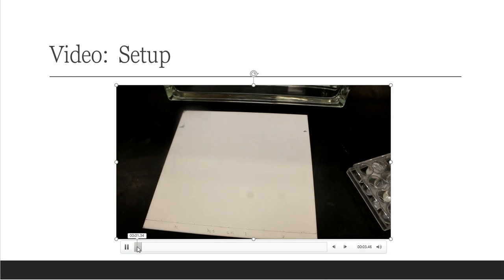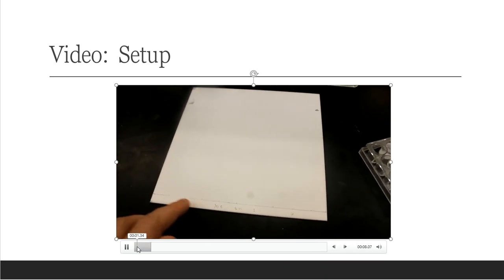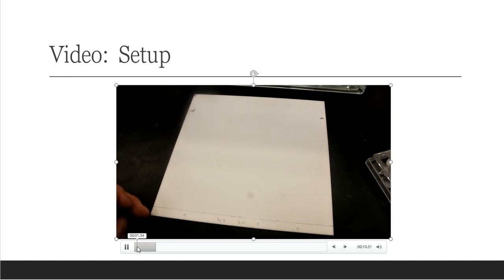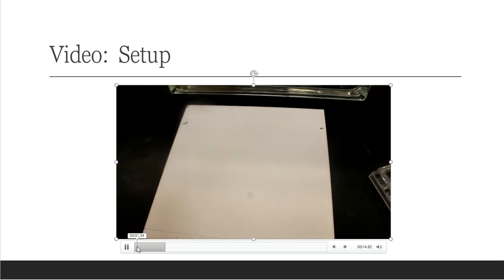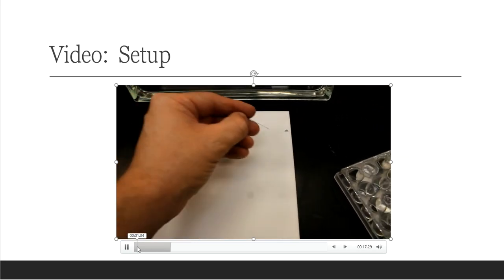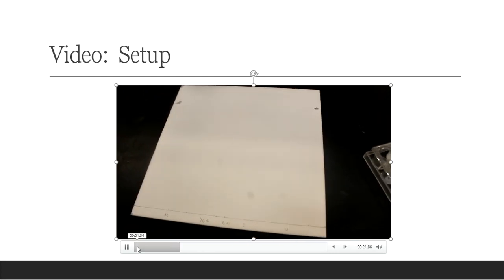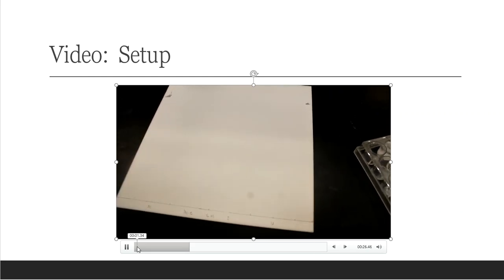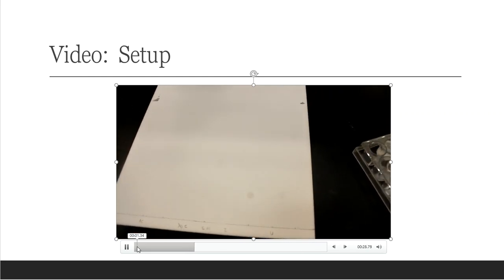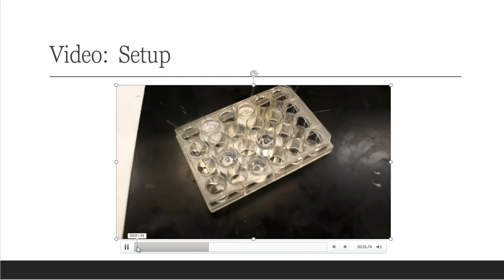Okay, folks, so this is the TLC plate that you're seeing in the screen right now. And the TLC plate has been marked down here at the very bottom. You can see my starting line 1 centimeter up from the bottom. I really don't want to touch this plate over the surface, but I do want to look for damages, and I see damages up in the very top. And I want to stay away from those if I can. So that's the way that I have determined how to spot and where to spot onto the plate down here at the bottom. I want to stay away from those smudges that are showing up at the top of the plate.